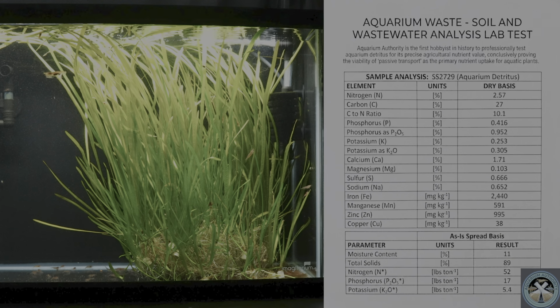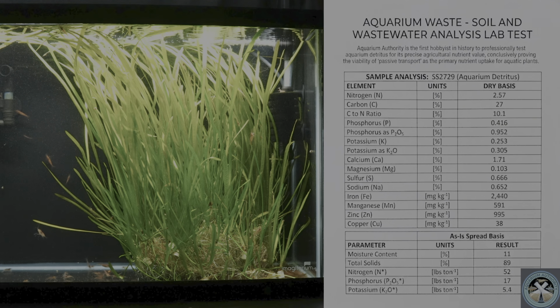If you were to just grab a handful of this stuff and toss it into your garden, or take a net and swish it around and catch as much detritus in that net as you can, and then lift it up out of the aquarium, this is going to be the as is spread. It's less pure of a result than testing for the dry basis because some of the weight is just going to be moisture in the form of aquarium water.